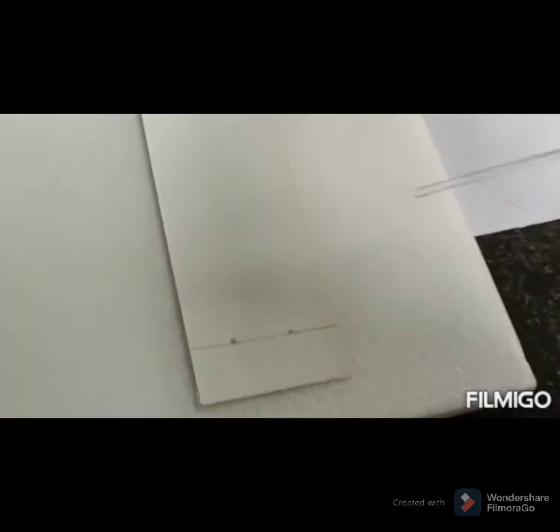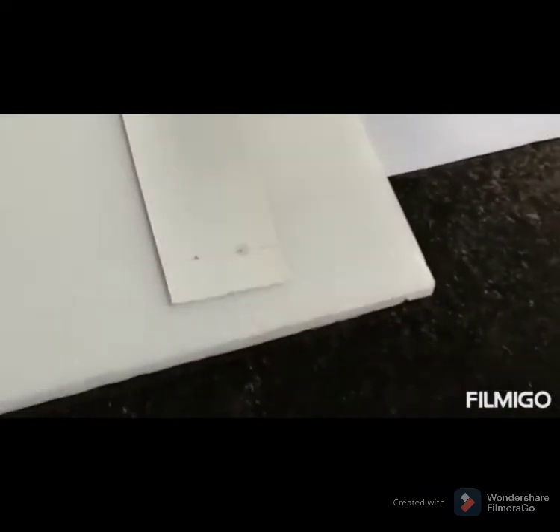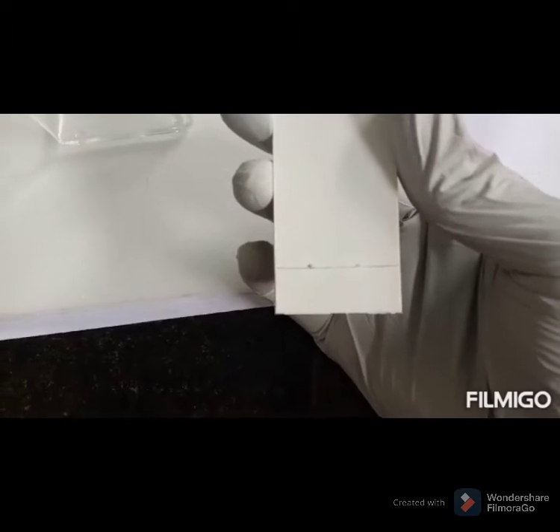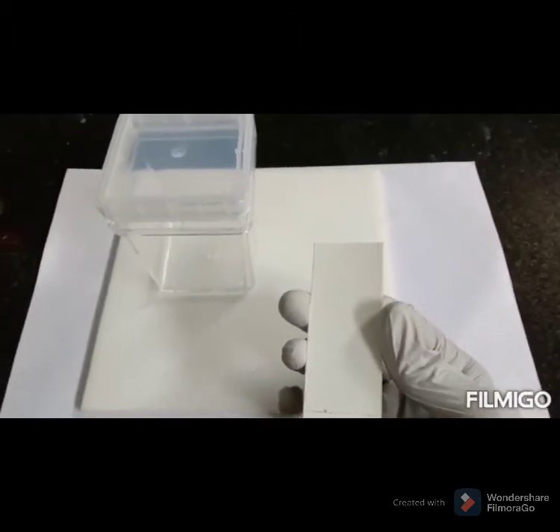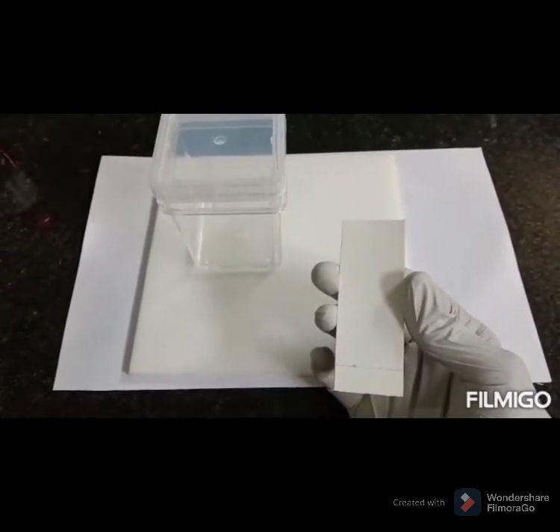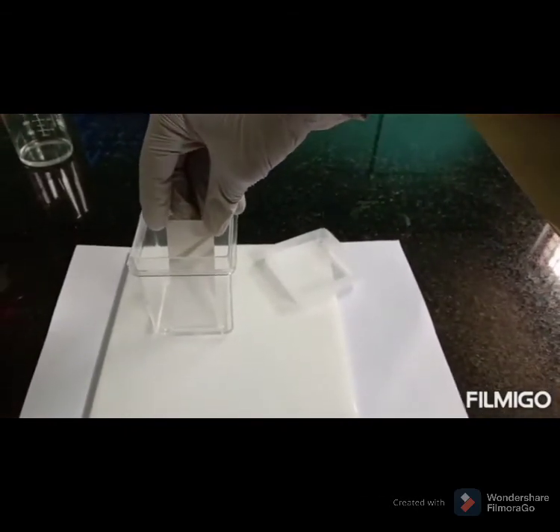The sample is absorbed onto the plate and may form interactions with it, and the plate is now allowed to dry. The dried plate is dipped into the chamber containing the mobile phase solvent mixture, and care must be taken that the spots are above the surface of the solvent. Afterwards, the container is closed and sealed.